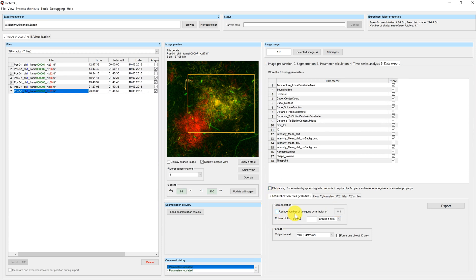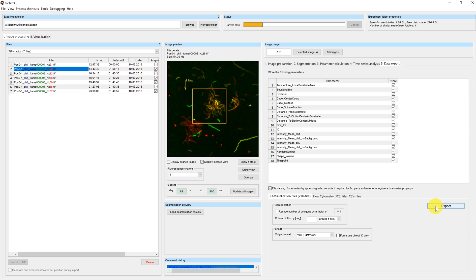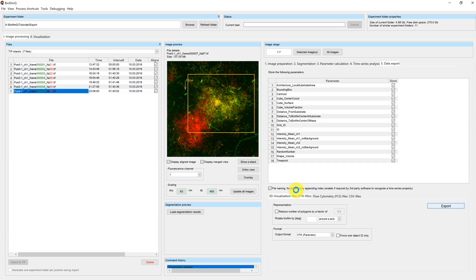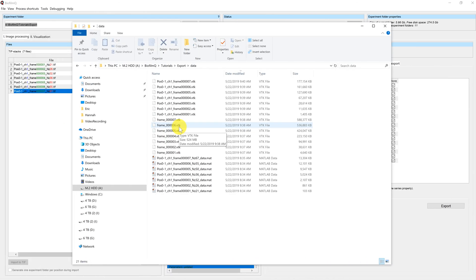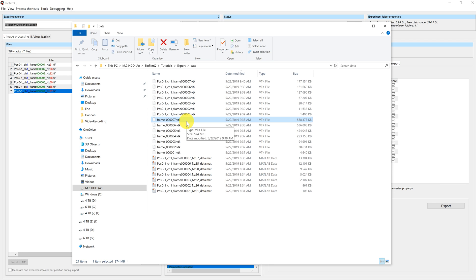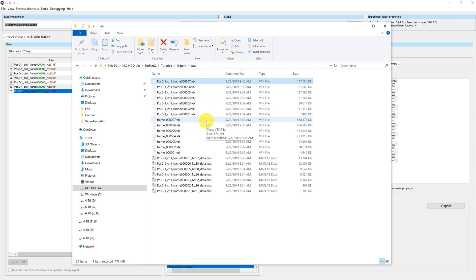First, we need to create two datasets with different file naming. I quickly enable the checkbox to create files which do not have a reduced number of polygons. Next, we create a dataset where we reduce the number of polygons by a factor of 0.3. The default factor should work quite well for all datasets we have seen so far. In the data subfolder of our experiment folder you can see that we now created two different VTK time series — one with only the frame number as a file name, where we haven't reduced the polygon count, and one with the full file name where we reduced the polygon number by a factor of 0.3.